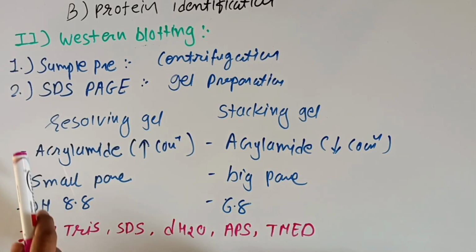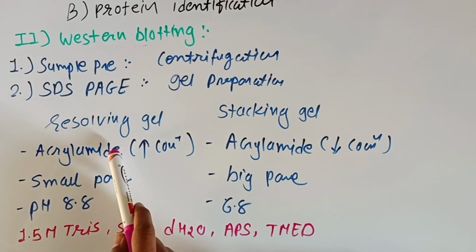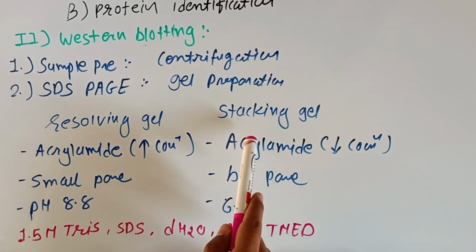Now after sample preparation, this electrophoresis is applied. For that, two kinds of gel are prepared: a resolving gel and a stacking gel.